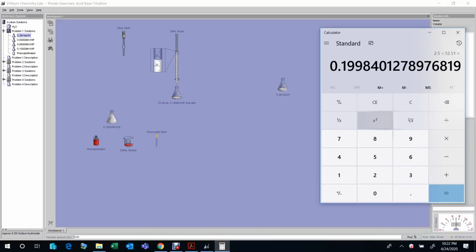So here you see that is the exact concentration. In the real experiment, when we add solution as we approach the equivalence point, when sodium hydroxide is dropped into the solution, locally some solution will change its color, and that tells how close the titration reaches the equivalence point.